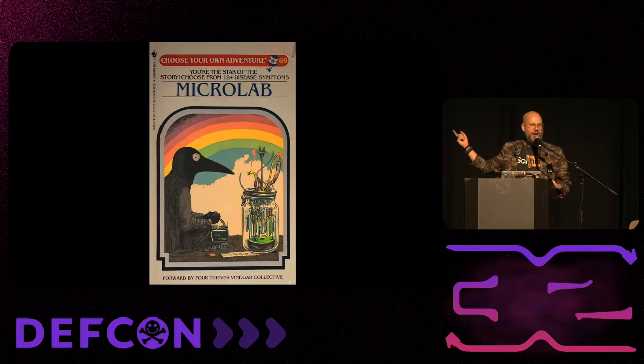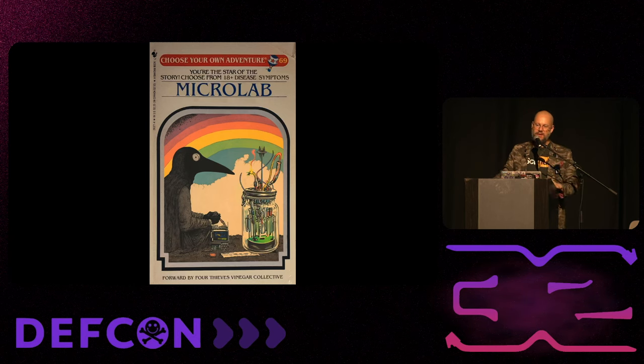Again, it also supports branching. This is a big deal because the machine is not going to know if things aren't working, but the machine can ask you to check. So let's say, and this is a fairly common thing in chemistry, something just doesn't dissolve, right? So you've stirred it in solvent for a long time. It will say, are there still particulates? And you can then tell it yes or no.